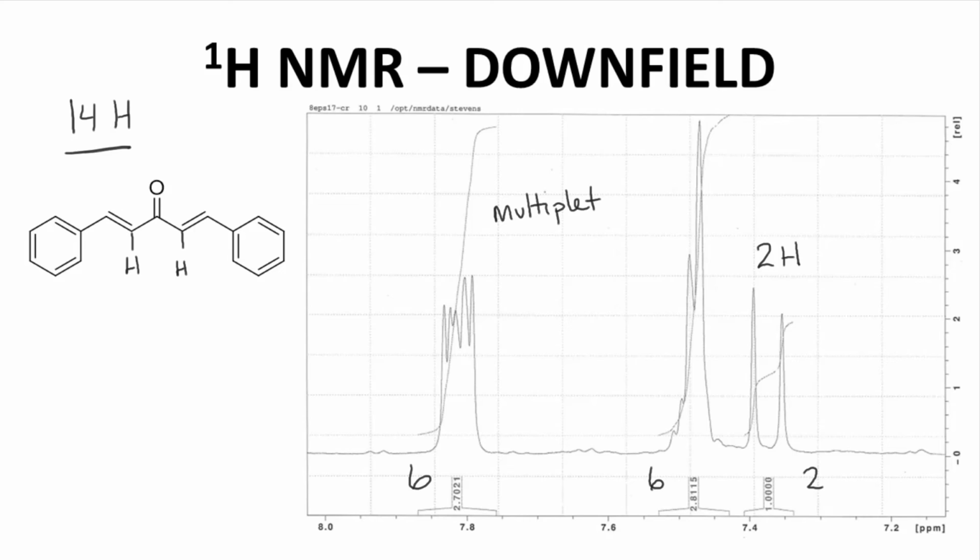This signal consists of the other alkene hydrogens, the beta hydrogens, and probably these 4 ortho hydrogens on the aromatic ring. That is a total of 6 hydrogens. The remaining hydrogens are all under the multiplet in the middle of the spectrum. This multiplet includes both the meta and para hydrogens on each ring. There is not much to interpret in this spectrum because so many of the hydrogens overlap. Regardless, all the hydrogens are present and have a reasonable chemical shift.